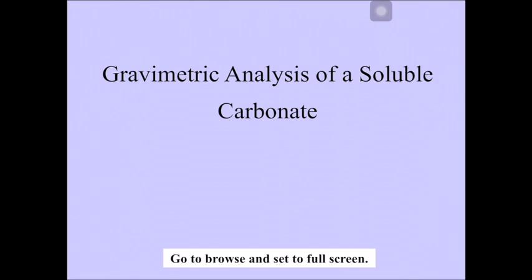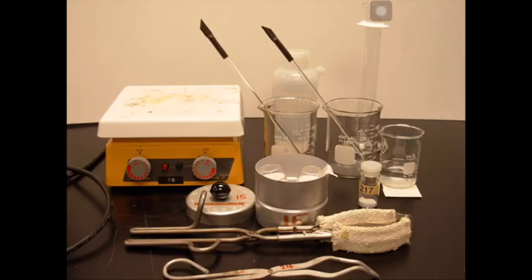Before talking about our experiment, I would like to introduce the gravimetric analysis of a soluble carbonate. This one is not your experiment. Your experiment is the determination of percent sulfur in a soluble sulfate salt. So this one is not your experiment yet.